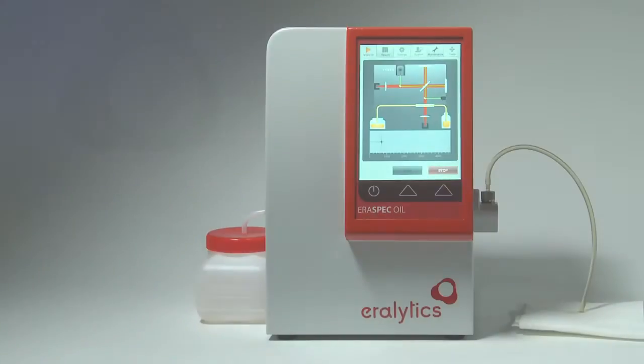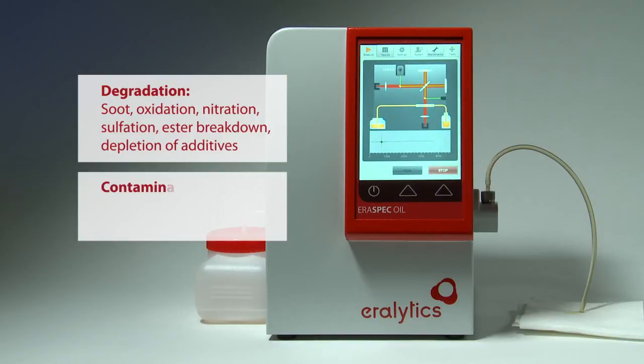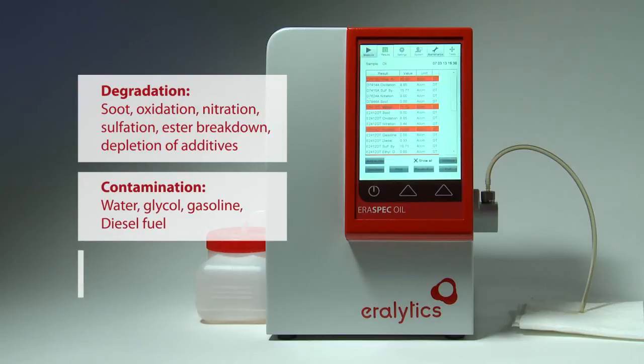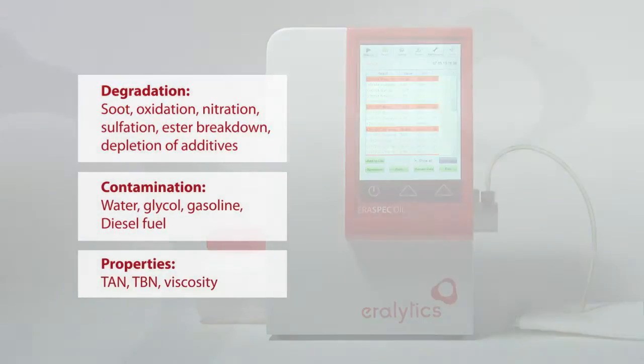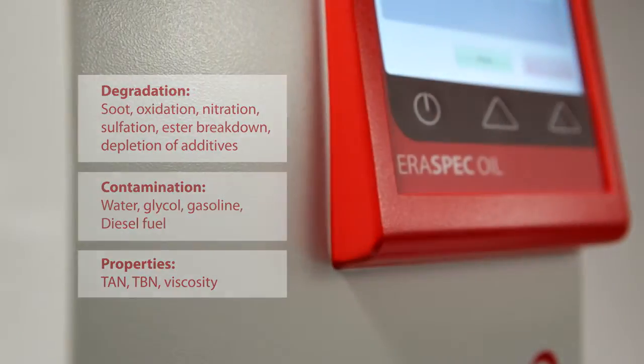Testing includes analysis for degradation parameters such as soot, oxidation, and nitration, as well as contaminants such as water, glycol, and fuels. Additionally, the ERASPEC Oil calculates total acid and total base numbers and predicts the viscosity class.